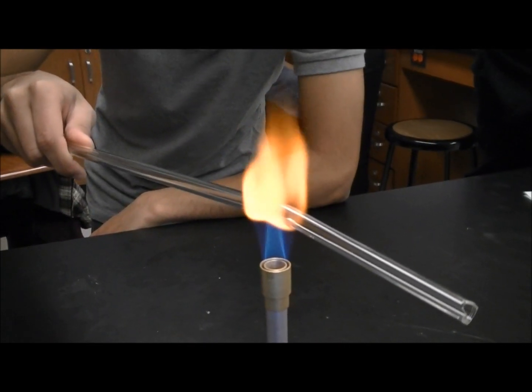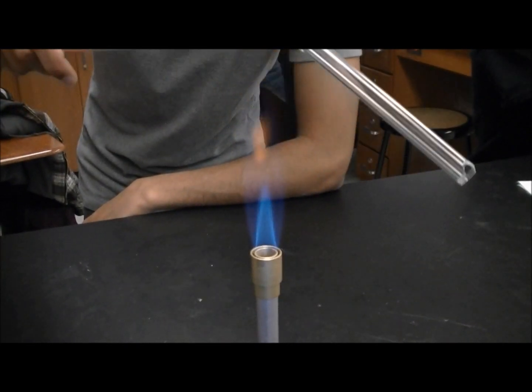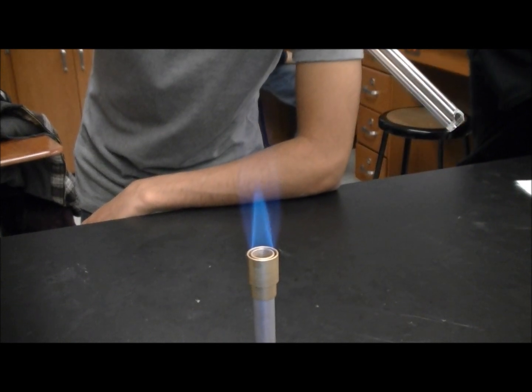You see bending? Oh, I see bending. Oh my god. It's starting to melt. It's starting to melt — didn't she say not to do that? Oh no. What if it just like breaks?